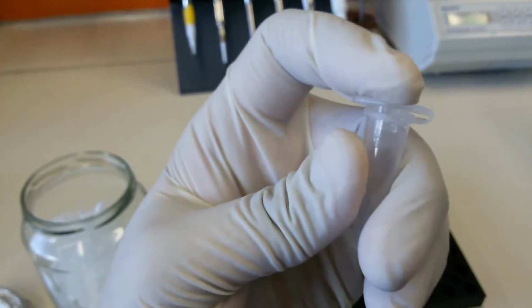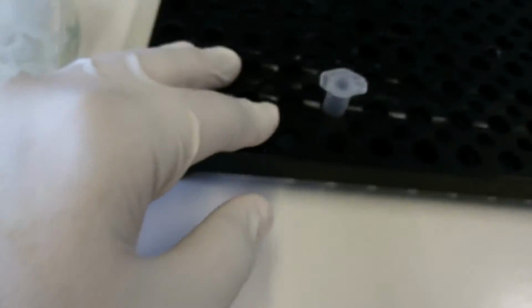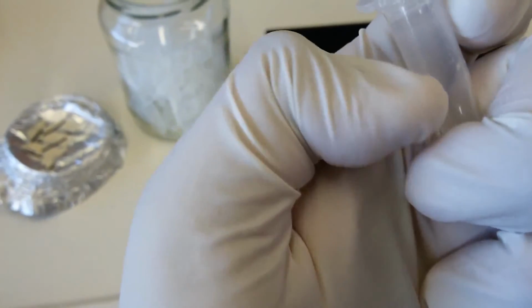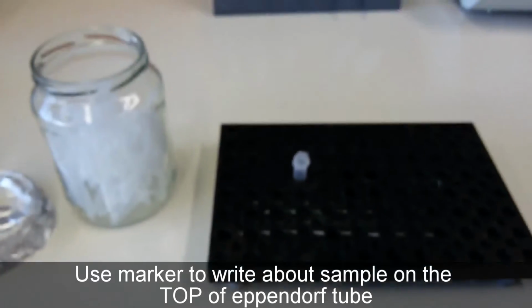That's how we do it. We close it, and we can open them like this. And this is the stand which we use. For example, put it like this so you can see it from the top. That's how you do it. You put them, just ignore those small holes, they're for different Eppendorf tubes. So you put them like this, and on the top or on the side, you can write the name or something if you want to specify something.